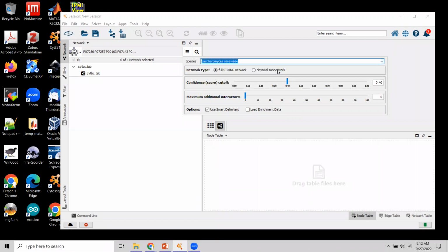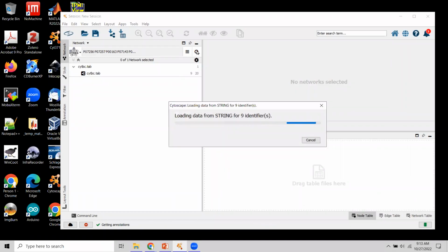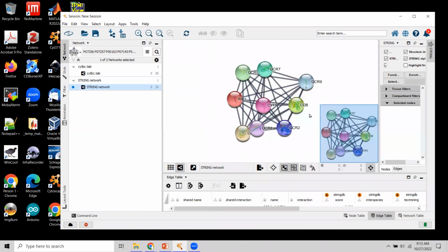Yes, here we are, and try. Okay, and here we've got the network that was provided by STRING.